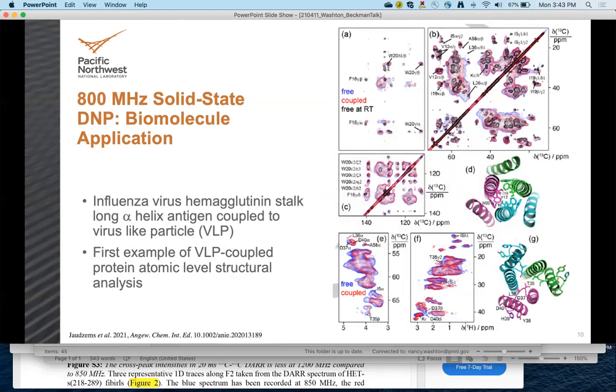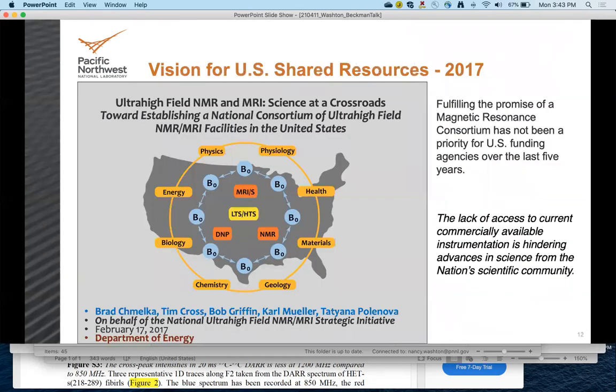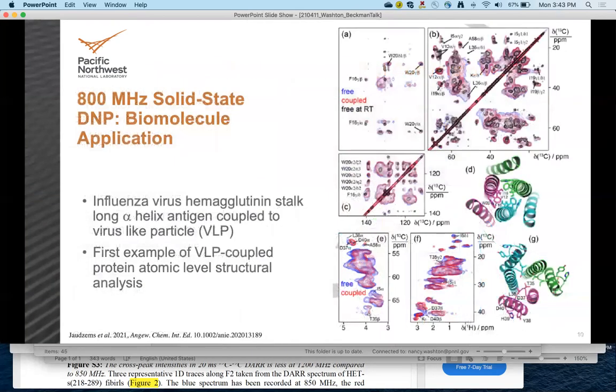So if we need to understand the structure of that protein in vivo, this brings us much closer to that than looking at the free protein. So the results are that the protein exhibits high structural similarity between the free and bound versions, but the structural differences that do exist were discernible under these experimental conditions. And this was particularly important, in fact, because this goes to vaccines and understanding how to make vaccines that are more effective and what to target.